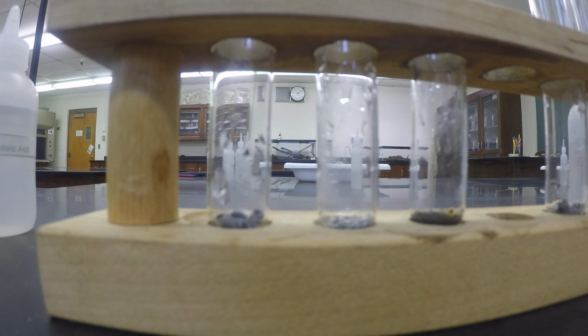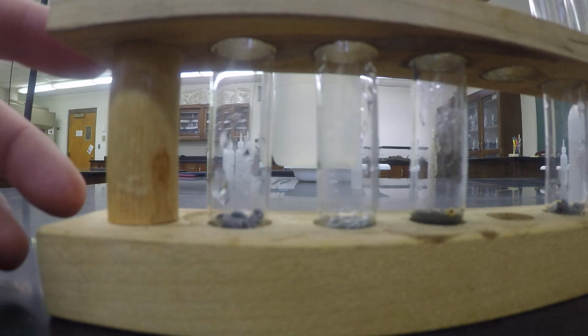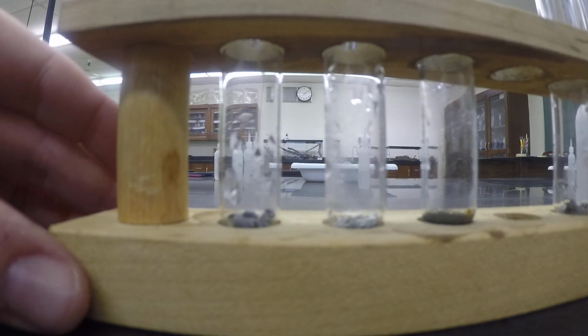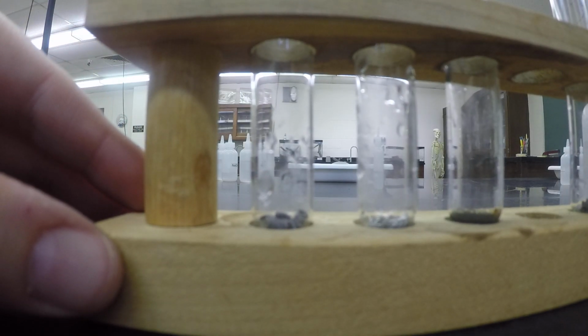Now I'm going to add 5 drops of hydrochloric acid. If you can see this back here, it's HCl. I'm going to add 5 drops of hydrochloric acid to each one of these. What you're looking for is some type of reaction. You're looking for bubbles. So I want you to watch closely.